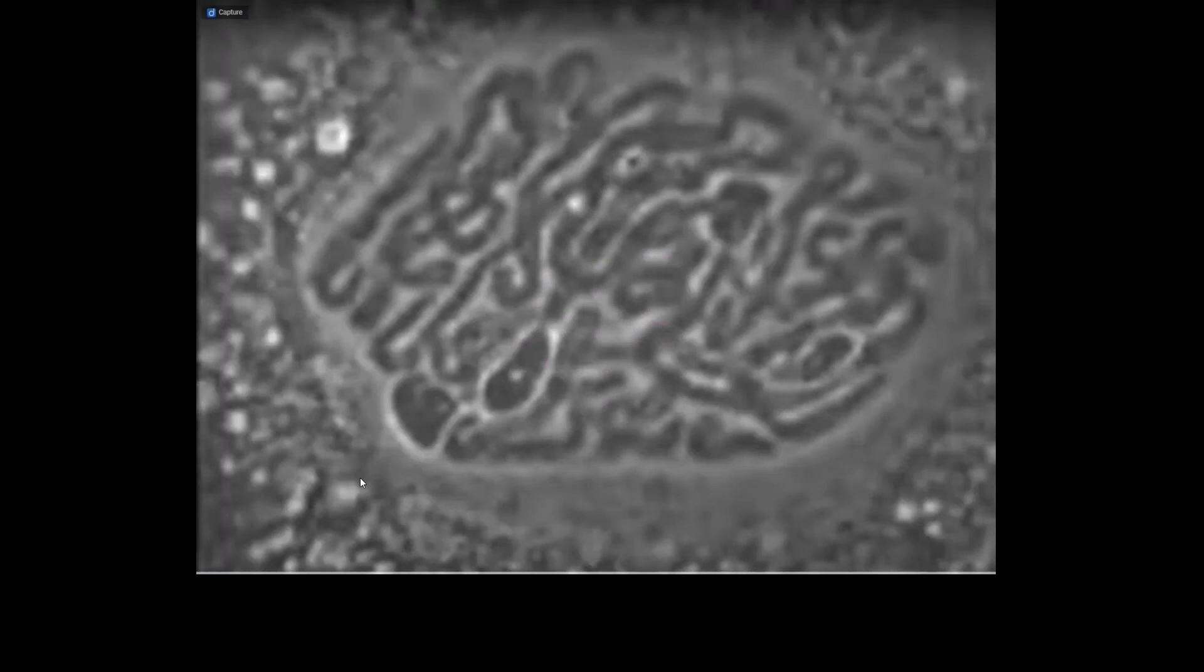Okay, so we can see here that this cell is in prophase. We can see the chromosomes in various degrees of formation, ranging from very long and thread-like structures to shorter, more distinct entities. We also can see that the nuclear envelope, which normally surrounds the chromosomes, is beginning to disappear.